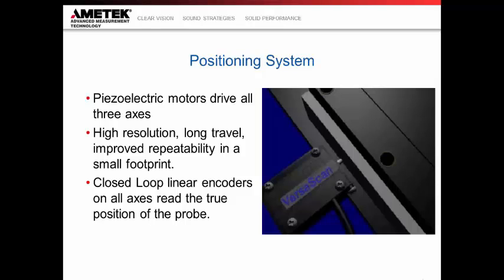And you can see in the video there's a wiggle to the arm as it starts driving the stage, and it starts inching along. So it's really a bidirectional piezo. One motion is to pull the arm away, another one is to move up and reposition the arm, and then go in and grab the stage and move it to the next position. What that does is it allows us to take the high resolution and repeatability and all the positives of a piezo and expand it to a long area travel.